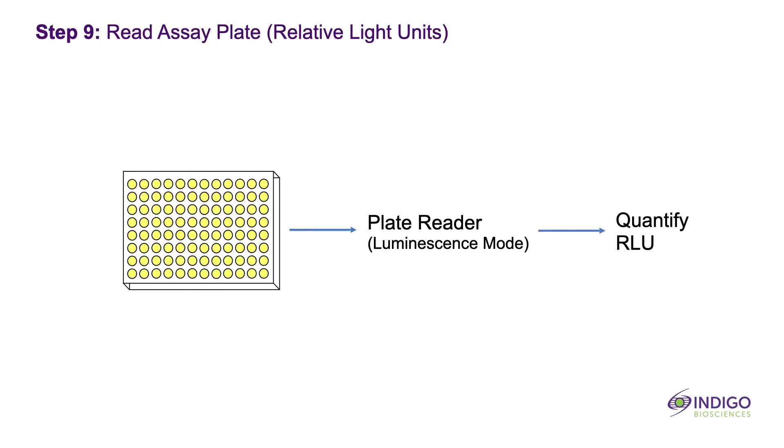Transfer the assay plate to the plate reader and press START to quantify luminescence per assay well.